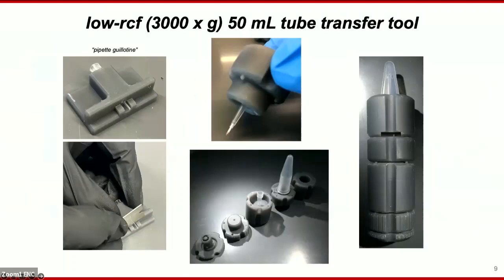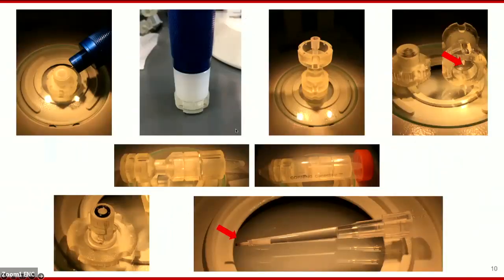You just take a razor, put it up against this bar here, and then cut off the pipette tip to the point where the opening is now 0.7 millimeters. And when you assemble the tool together, you can then insert the rotor into the pipette tip with a snug fit. And of course, our designs have evolved over time.